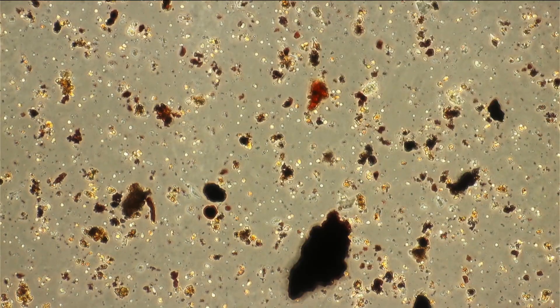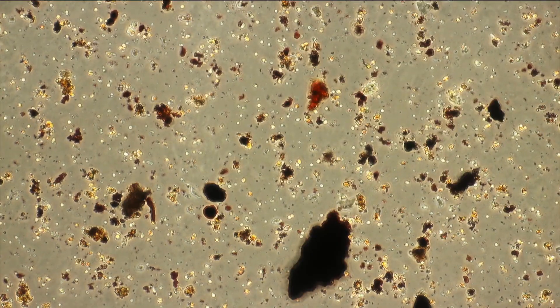Not surprisingly. Of course, you always want to make a double check and control. I put some fresh rice wash water also under the microscope. And of course, no bacteria were present.